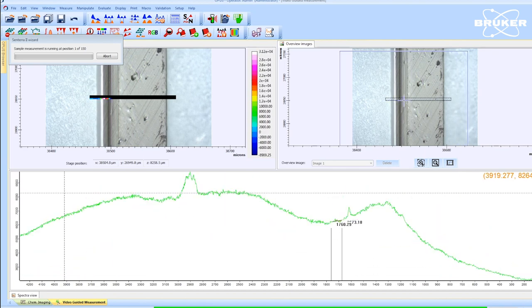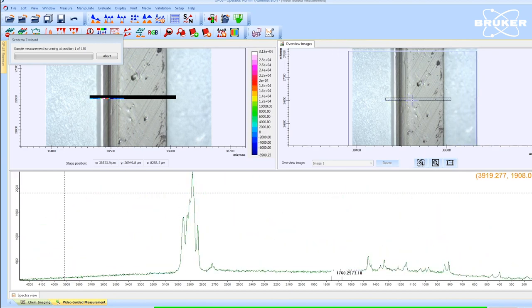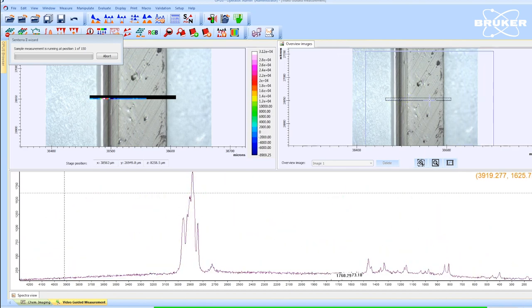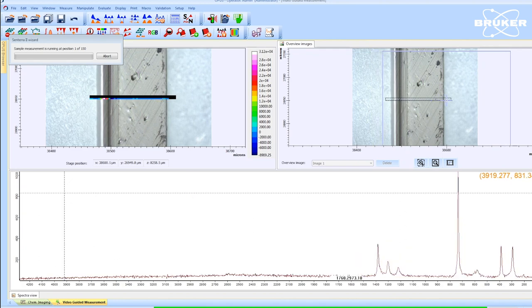During the automated analysis, a live chemical image provides a preview of the sample's composition.